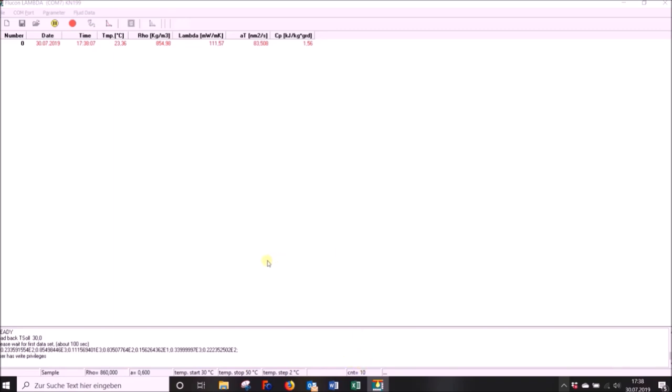Please note that thermal conductivity measurement requires thermal stability, so it also requires a bit of your patience. Depending on your sample and temperature settings, Lambda measurements may take 4 to 16 hours.